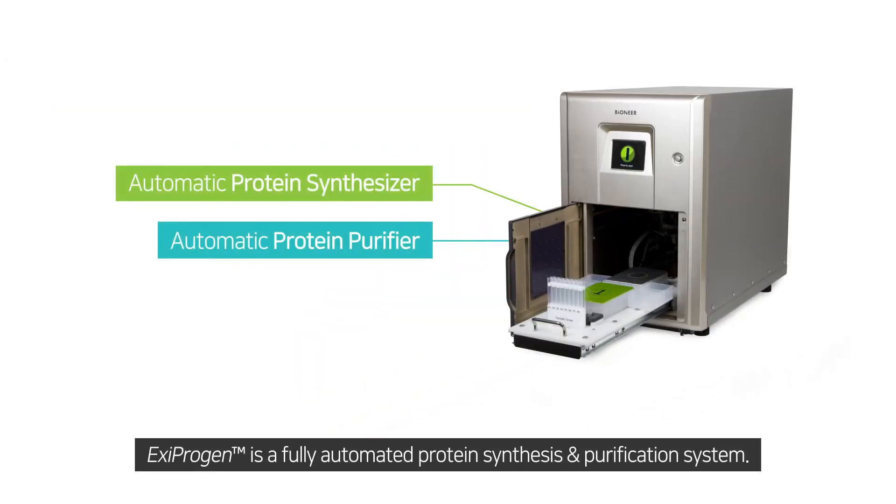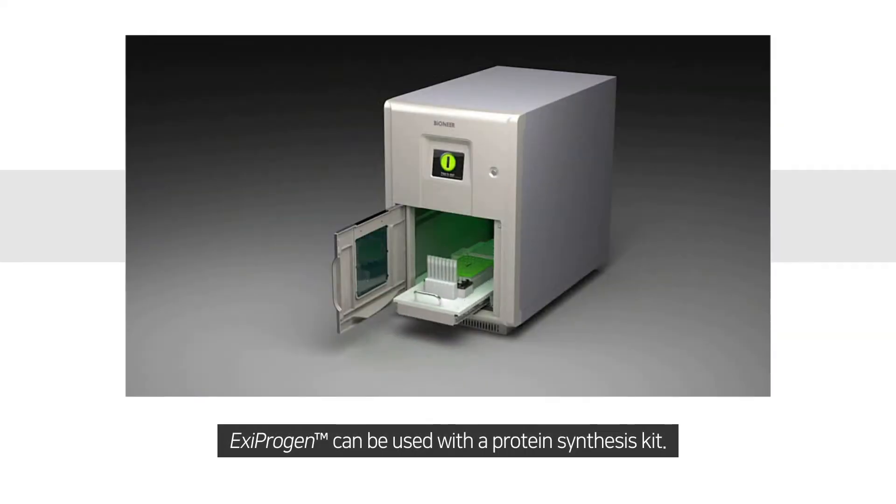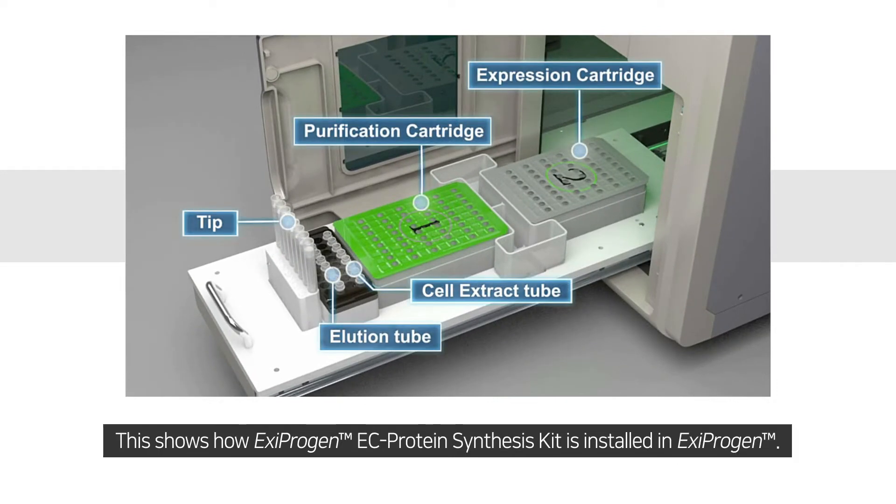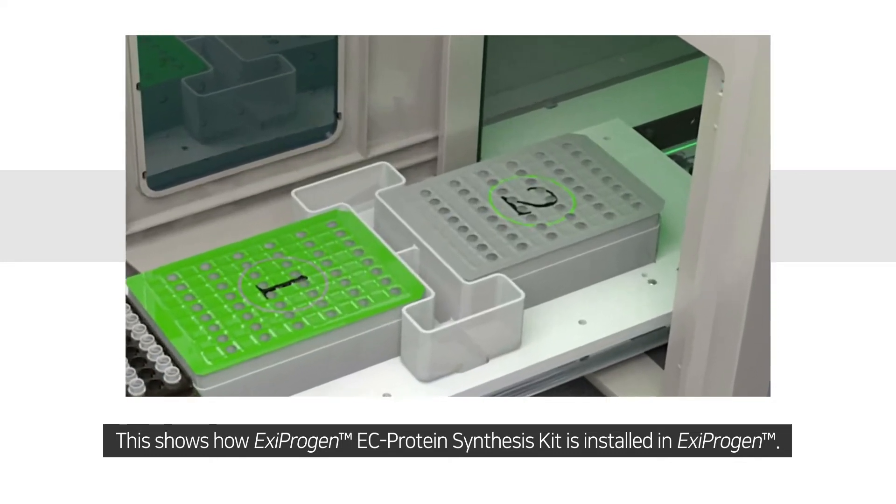Ixiprogen is a fully automated protein synthesis and purification system. Ixiprogen can be used with a protein synthesis kit. This shows how the Ixiprogen EC protein synthesis kit is installed in Ixiprogen.